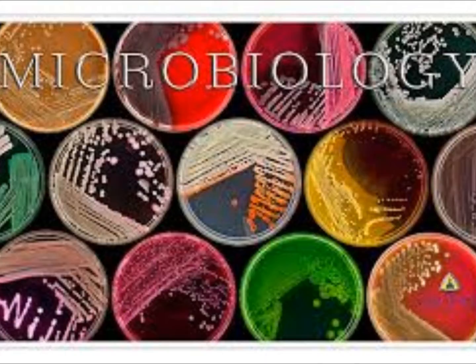You don't have to gram stain. We're only gonna gram stain the first organism that you started with, and then tomorrow, everybody can look at all of them, but we're only gonna have one set of slides for each organism. We'll put them at the desk. You've gotta do all 7, so I need your plates.